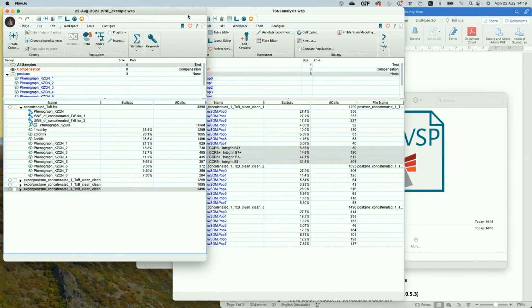Yeah. So for example, my pipeline previous to this had always been a hierarchical gating strategy where you're looking for what you're already looking for. I'm going to gate on my CD3, CD4, CD3, CD8, and then look at this and then this and then this. And you're going down that pipeline in all of your individual FlowJo samples and exporting data somewhere and then looking for differences.